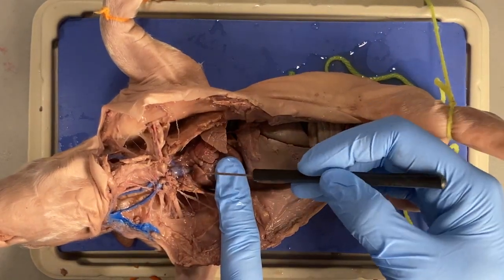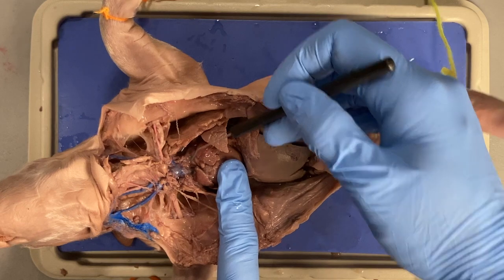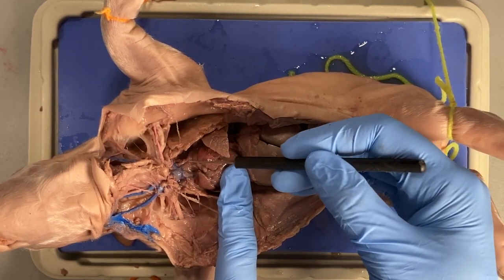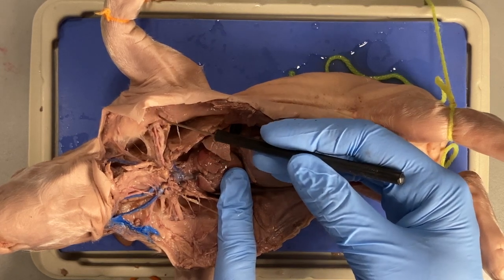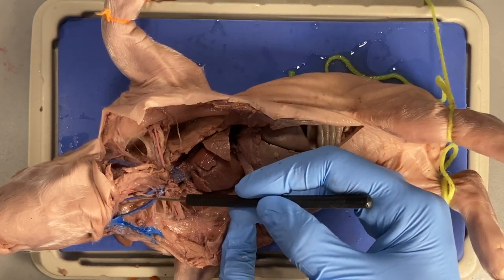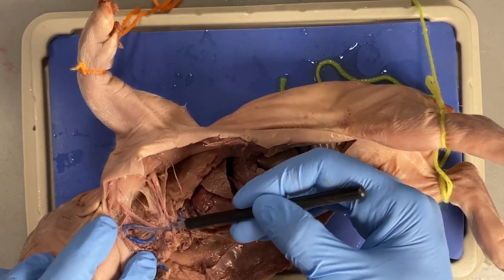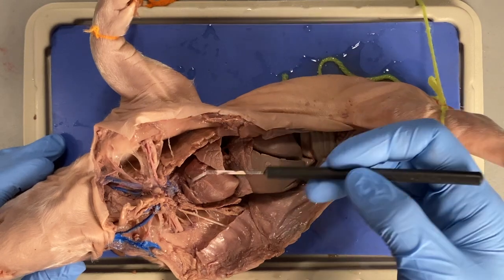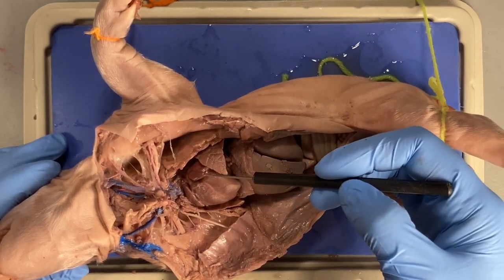I'm going to go over how you can identify these different vessels. We always start from the heart with its two auricles and the pulmonary trunk. Behind the pulmonary trunk is the aorta, and behind the aorta is the superior vena cava. We can see the subclavian artery going out towards the arm on both sides, and I can also see the common carotid coming up on both sides. I would like you to be able to identify the subclavian, the common carotid, the aorta, and the pulmonary trunk.